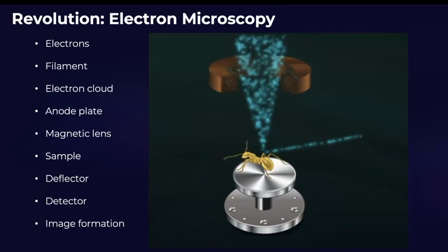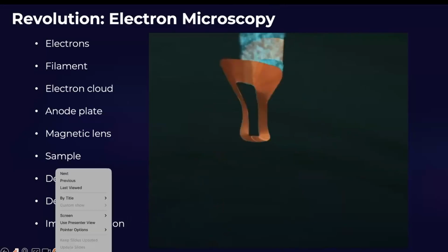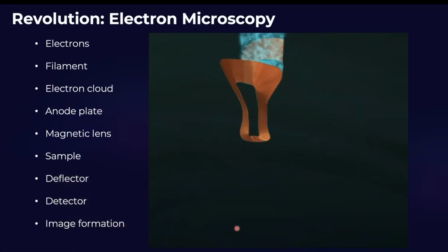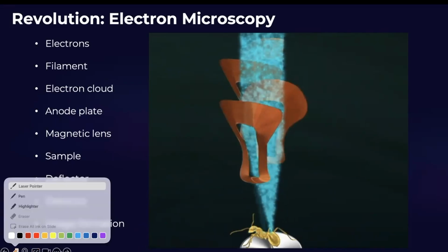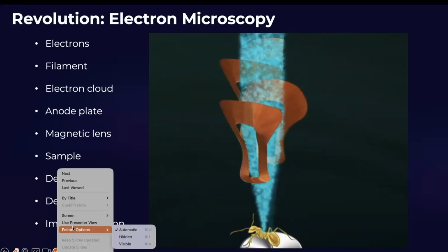And then once this beam of electrons interacts with your sample, you have many phenomena because it is a high energy beam. Some electrons may be ejected from your sample, and X-rays can be ejected. So then you have a lot of detectors. When the electrons are generated, you can detect this. Through this, you will know where your sample is, where your sample is not.